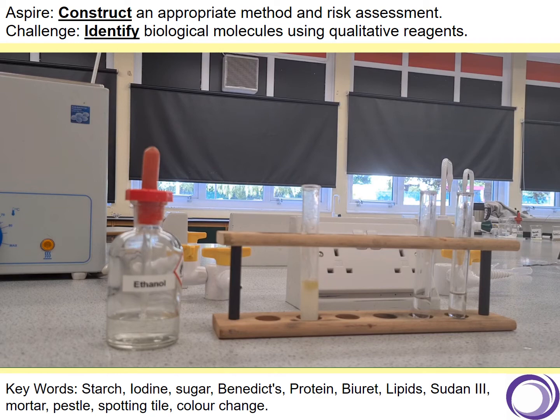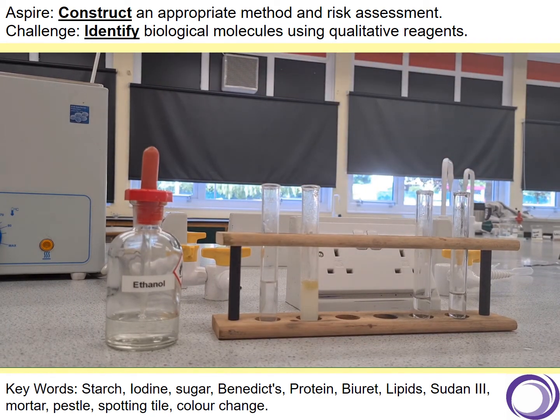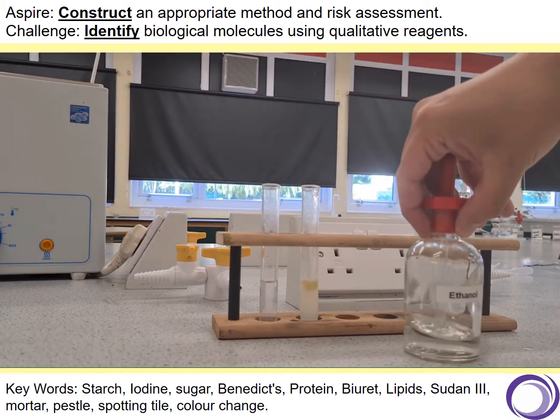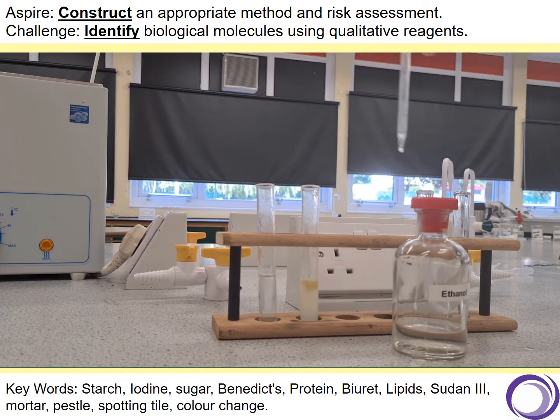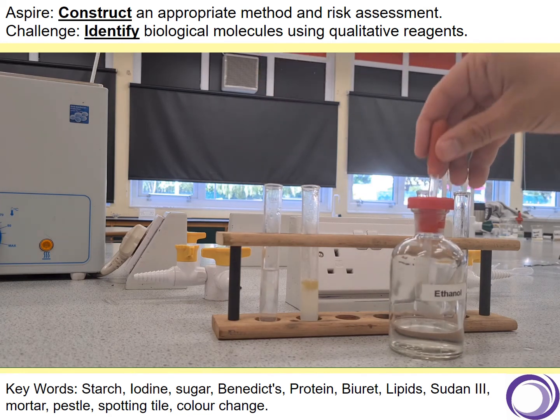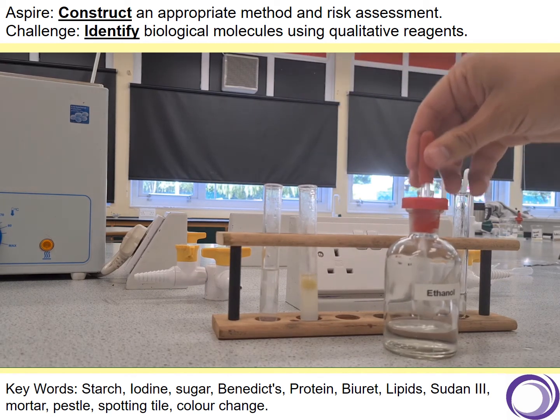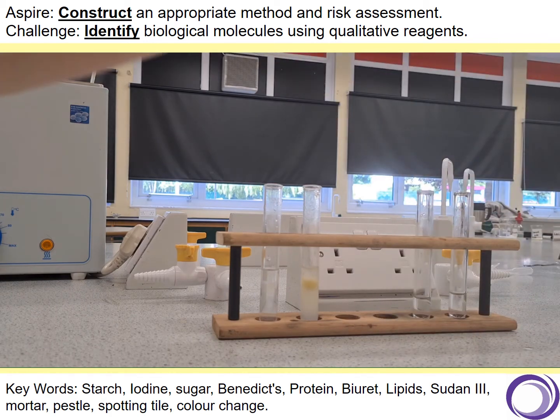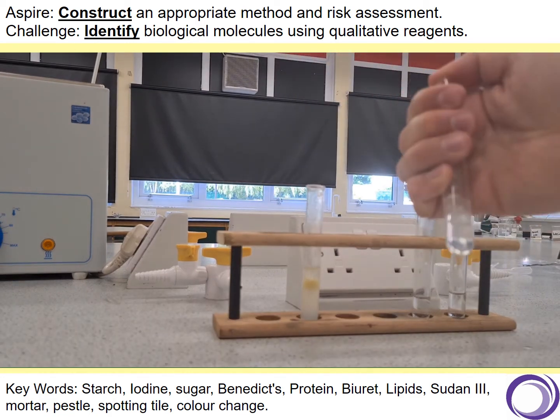Now there's two ways to do this one. I'm going to show you the ethanol one first. This is the one which is probably the easiest. Okay, so I can just add ethanol to each one of these test tubes. And into this buttered solution here. Okay, and if the solution turns cloudy, then fat or lipids are present. So give this another quick shake.